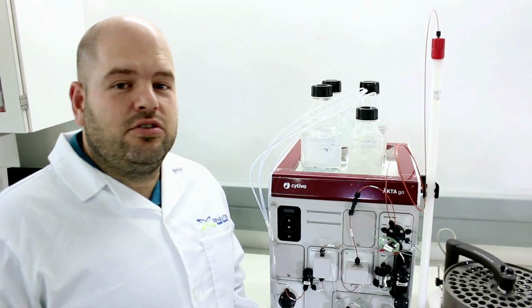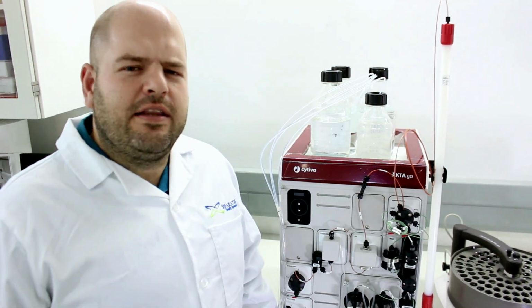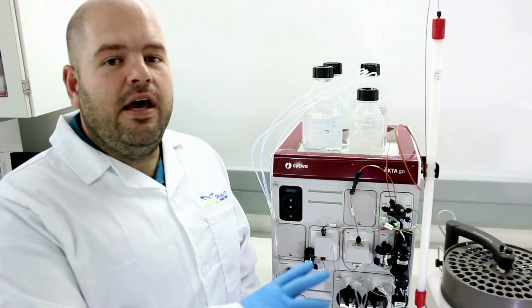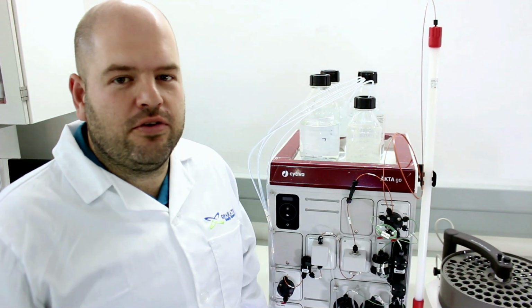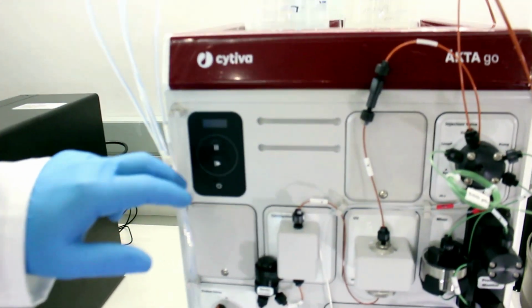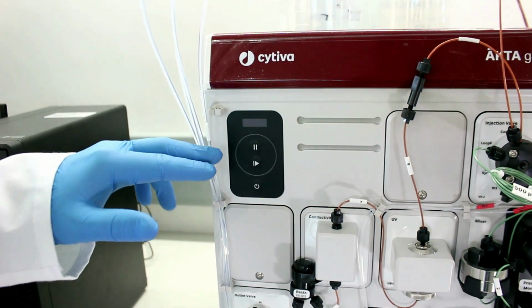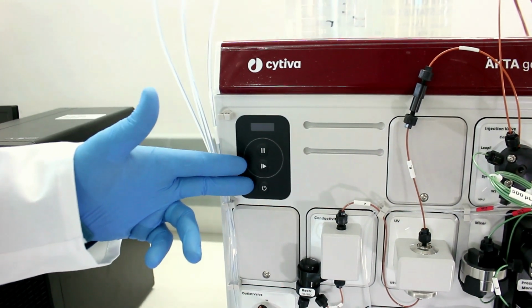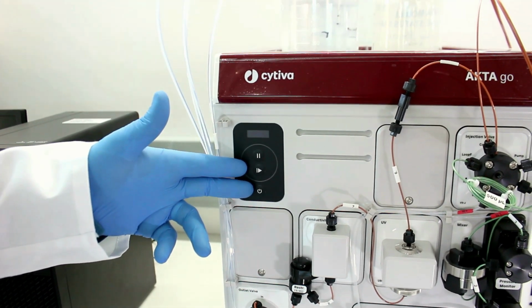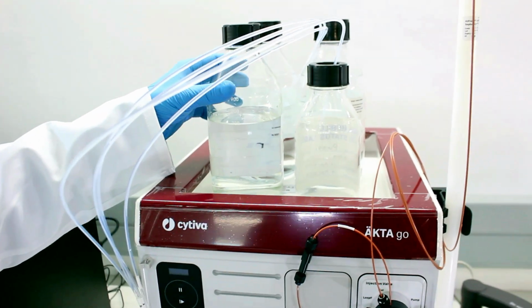So now I would like to talk a little bit more about the hardware and accessories of the AKTA system. I think the best way to address this is to speak about the flow path, and then we can go through each component in turn. We'll start off with the instrument control panel. It's color coded, so you can immediately identify the current status of the system. It's got a power off, a pause, and a play button if you wanted to pause something to make any adjustments.